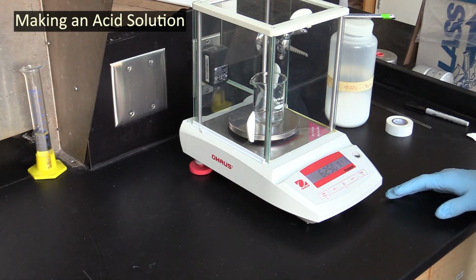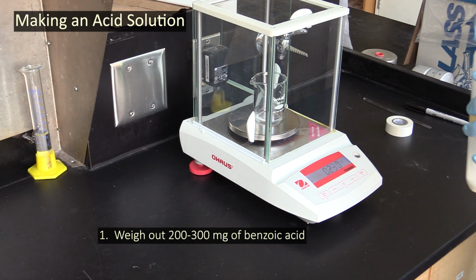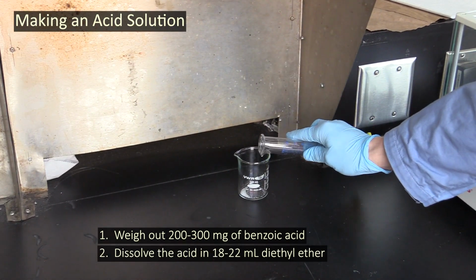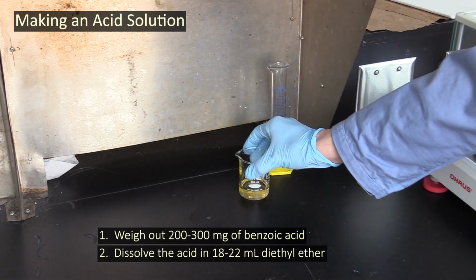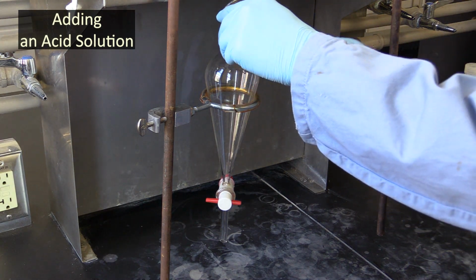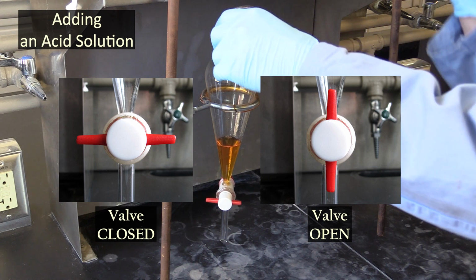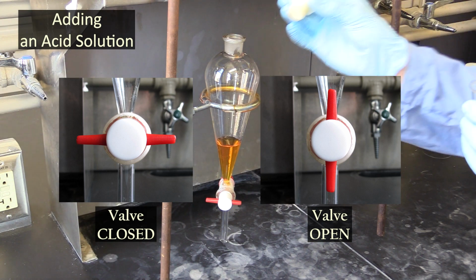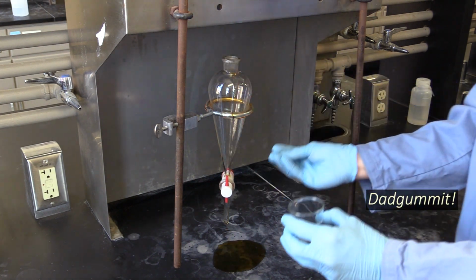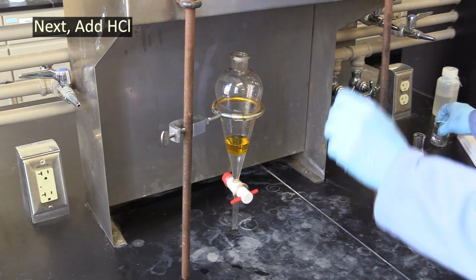The next thing you'll need to do is make a solution of benzoic acid. Do this by weighing out between 200 and 300 milligrams of benzoic acid and dissolve the acid in about 20 milliliters of diethyl ether. After all the acid has dissolved, add the solution to your separatory funnel. Oh, and make sure the funnel's valve is closed before you add the solution, with the handle perpendicular to the funnel's axis. If you don't, this might happen. Next, add 20 ml of hydrochloric acid solution and put the separatory funnel's cap on.